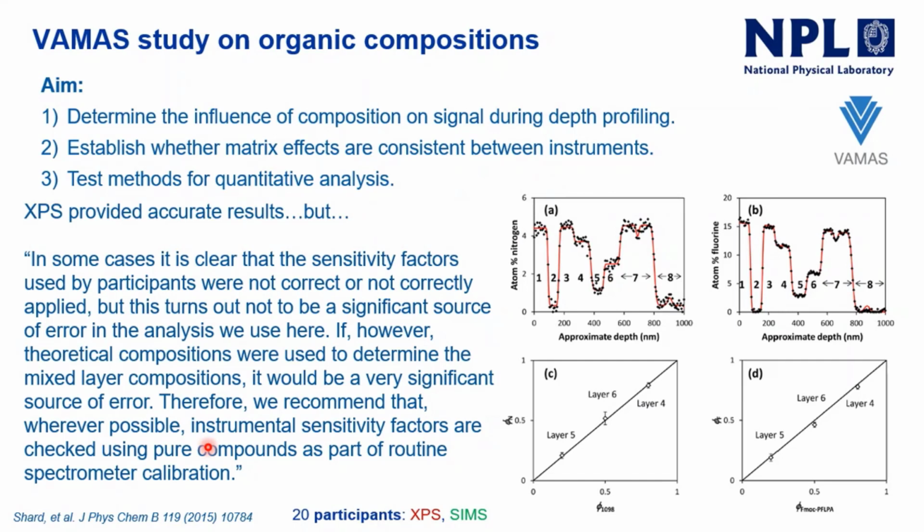And this, I just wanted to quote myself on this, because I was probably being quite polite here. In some cases, it's clear that sensitivity factors used by participants were not correct or not correctly applied.